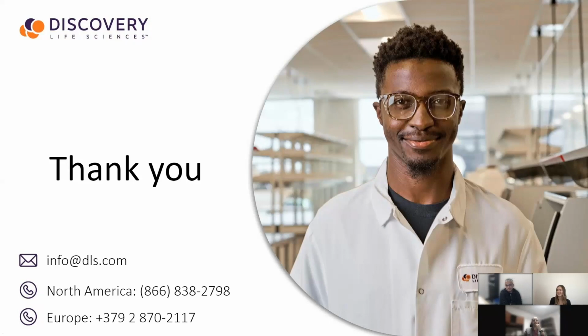Now, Eugenio, I have a question for you. Has Covaris developed or plans on developing a nuclei extraction approach from FFPE samples for epigenomic profiling purposes? Yes, we do have a solution for nuclei isolation from cross-linked material, also from FFPE. And as a matter of fact, we also have a kit that enables the shearing and fragmentation of DNA from FFPE.